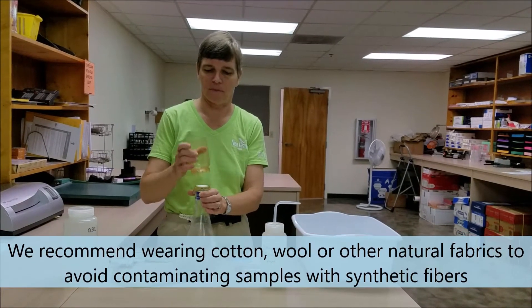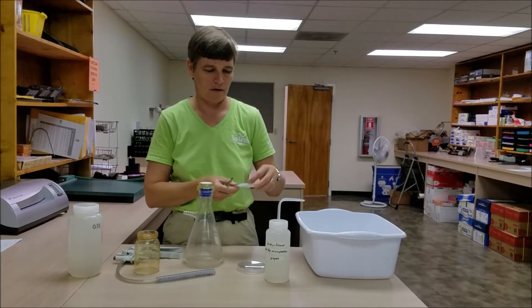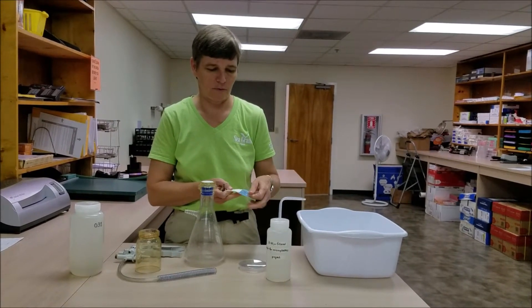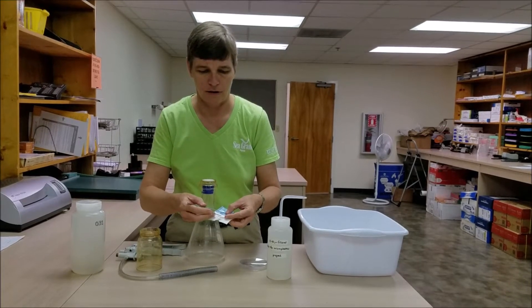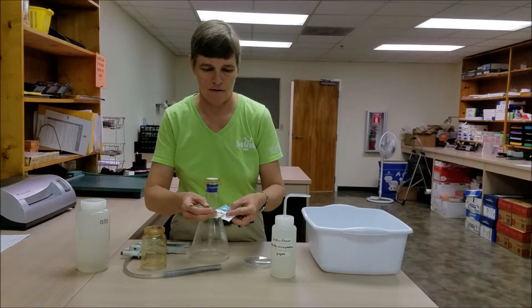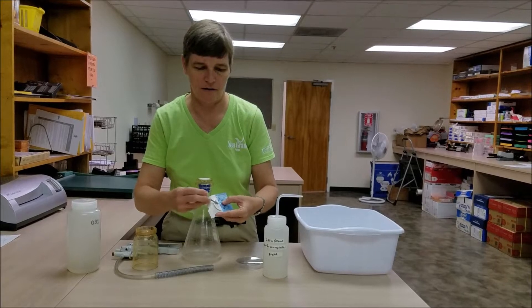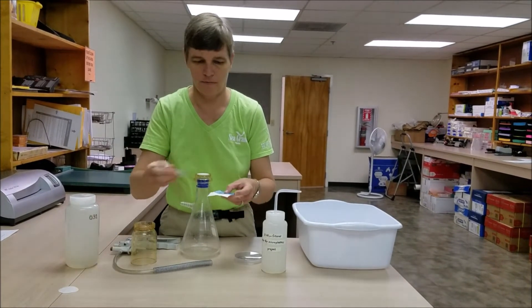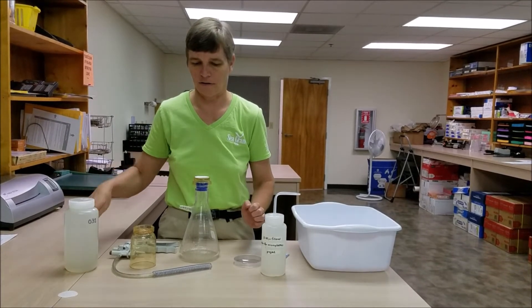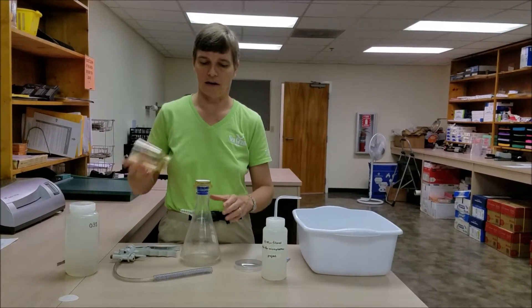Our first step is to insert a piece of filter paper into our filter funnel. We want to make sure that we remove the thin piece of paper overlying our filter paper and discard it. Then take our filter paper with the grid lines and place it on the base of the filter funnel holder so that the grid lines are facing up.